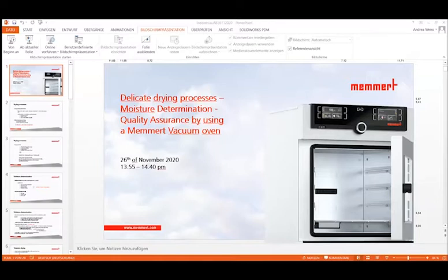Let me first of all welcome you again. Thank you very much for joining today's seminar. Selamat siang. Let's go on with the technical seminar on drying processes, moisture determination, and quality assurance by using a Memmert vacuum oven.